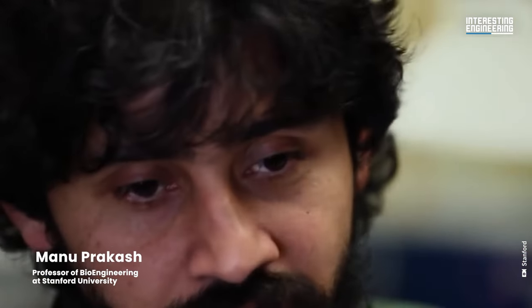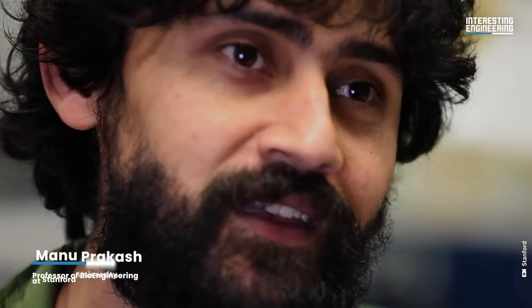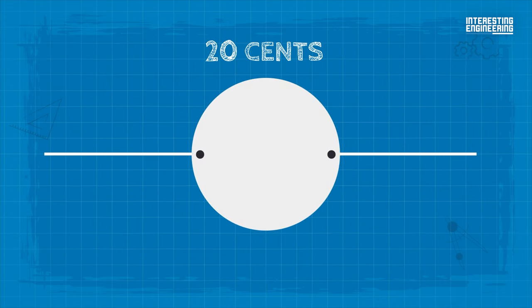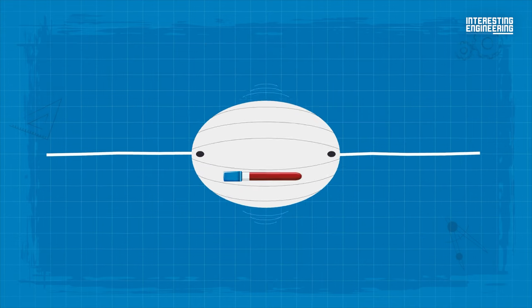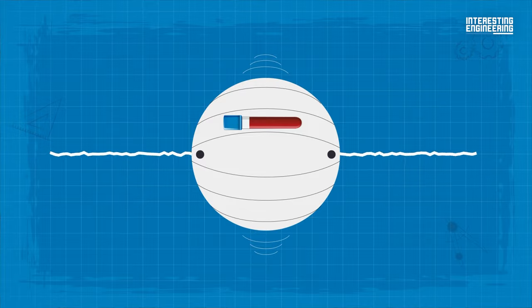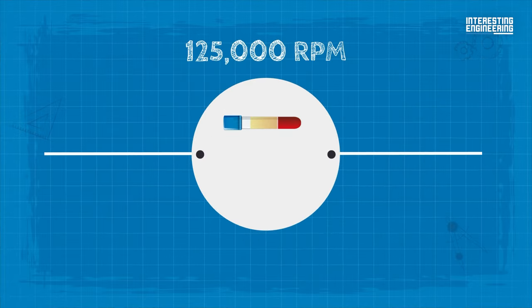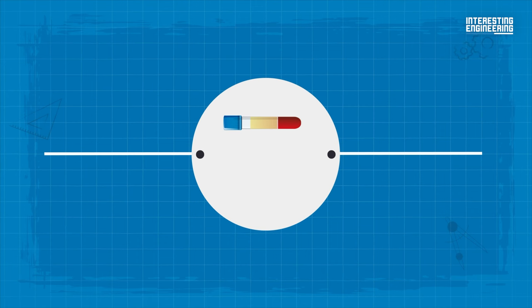This is a tool that requires no electricity, no infrastructure. You can carry them around in your pockets for a price point of 20 cents. Built from 20 cents of paper, twine, and plastic, this paper centrifuge can spin at speeds of 125,000 RPM and exert centrifugal forces of 30,000 Gs.